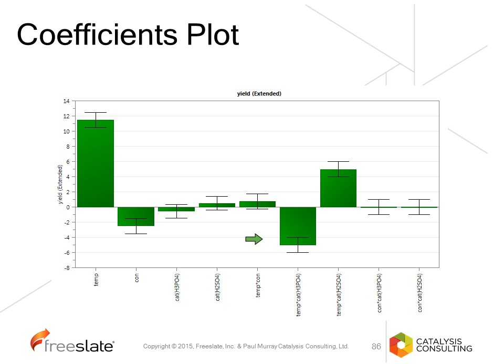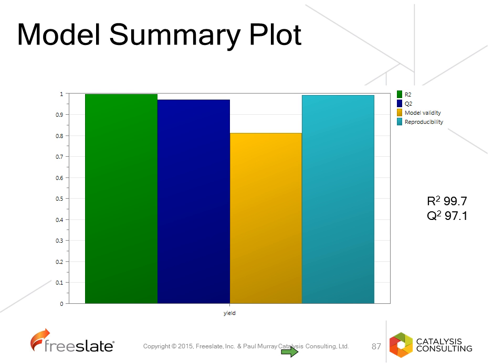So we have a potential interaction between temperature and concentration, temperature and the catalyst. So this is temperature in one catalyst, temperature in the other catalyst, and a potential interaction between concentration and the acid. We take this forward. This creates a model which explains all of the data. So we explain 99% of the results and it is very predictive.